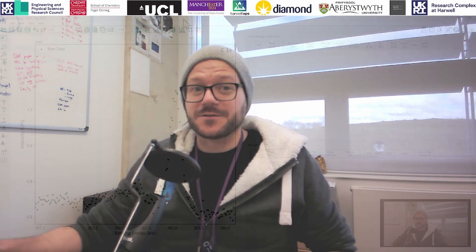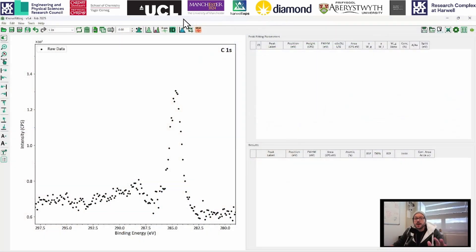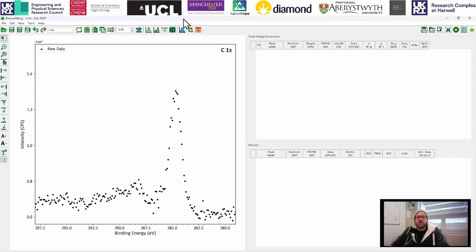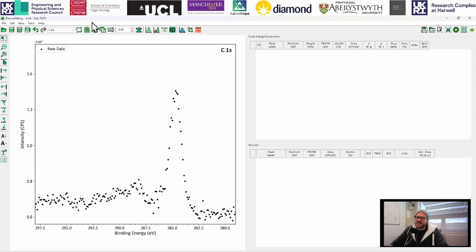So let's get started with some basic functions and we will return with some later videos for some of the more advanced functions. I've already loaded it in because it's quite big, so it just took a little bit of time to load.